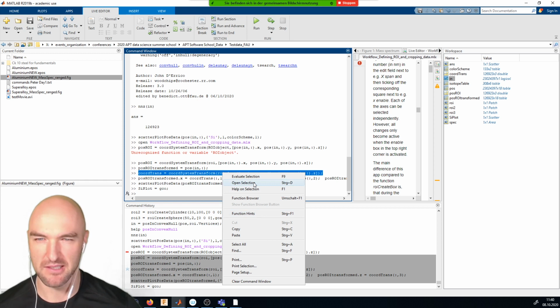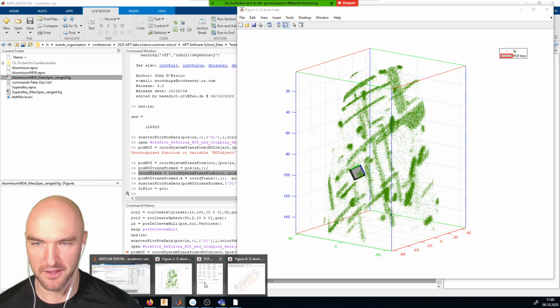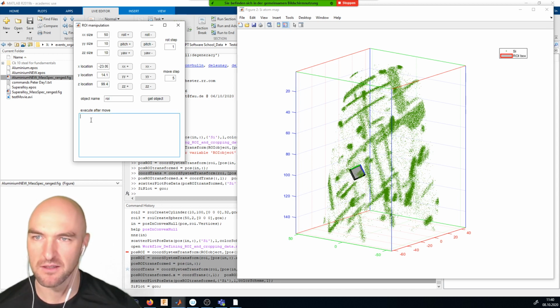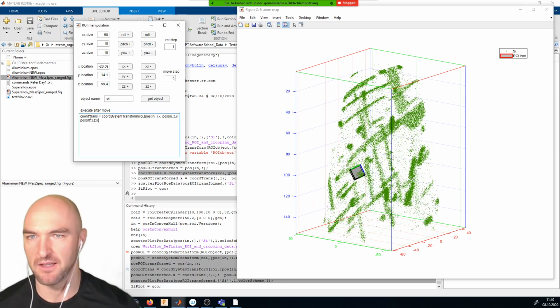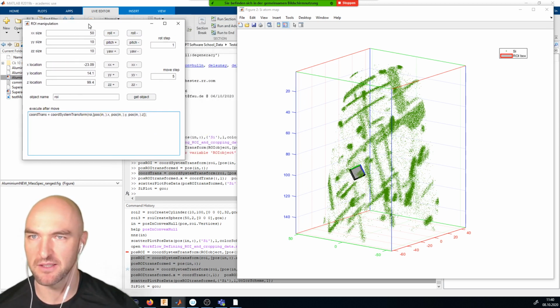I think the coordinate system transform itself is that function. I don't think that's a function that we have programmed, but it's not super complicated to program. Anyway, so we will put this into here, and I might just make that a little bit wider so that the whole line fits into here. And so we still do the indexing and the coordinate transform.